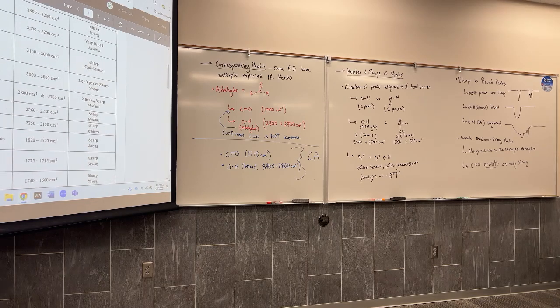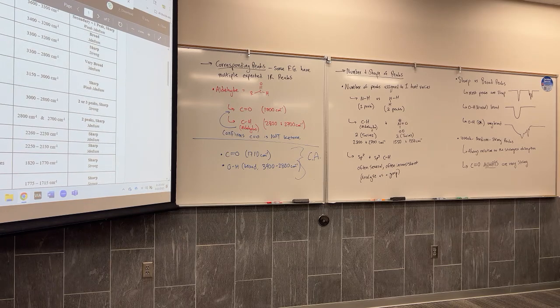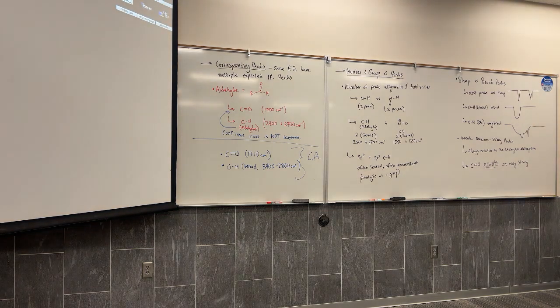If you have the C≡C triple bond of an alkyne, you should also find the CH of an alkyne, sp CH. There's a lot of information, but it's basically a puzzle. You get snapshots of what's in the molecule. In no way can you predict what the molecule is, or how it's attached, what its structure is, but you start to learn about bond types, which can give you some information about functional groups.